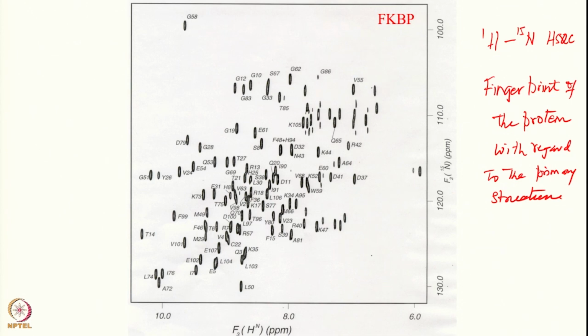Therefore, you also make use of this to find out the status of the protein in your solution. Then of course you have to devise conditions to break these aggregates and get single molecules. This is an extremely useful technique, and we will show you how this has been used to determine the folding pathways or aggregation pathways in proteins. This also has been a very useful procedure for this.